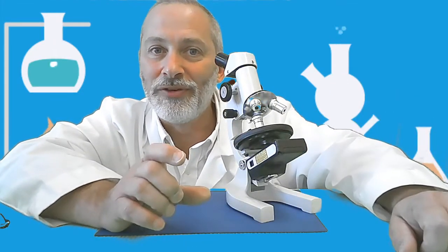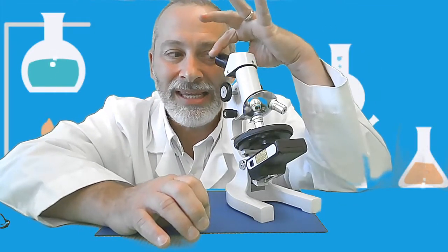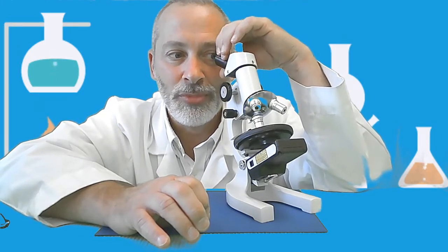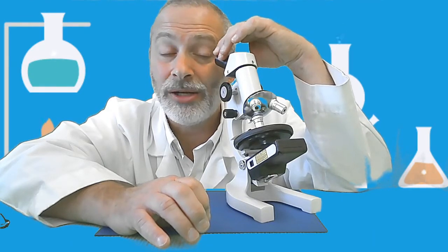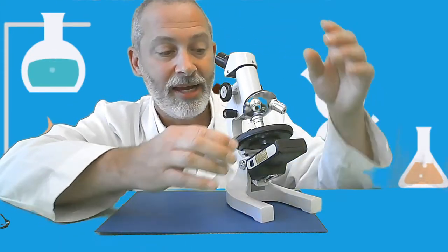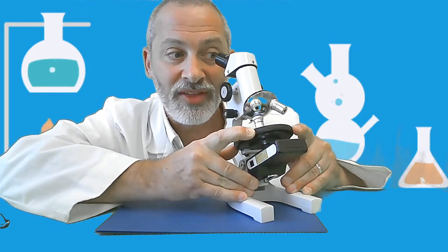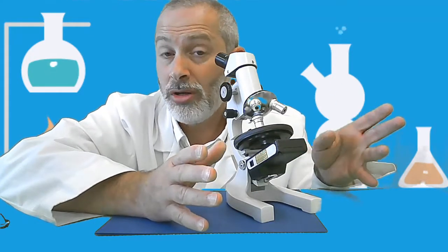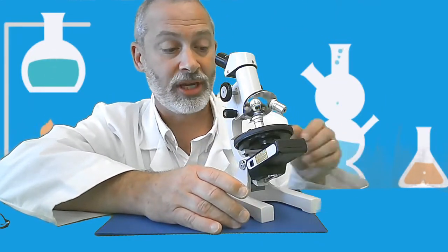Now, in your field of view, there's also a black needle. That black needle is connected to your eyepiece lens. And if you move the eyepiece lens around, it actually moves that little black needle around. So let's say you're looking for something in your slide. You can move and maneuver your stage so that that black needle is looking directly at whatever it is you are looking at, so that someone else, like your lab partner, can also look in there.